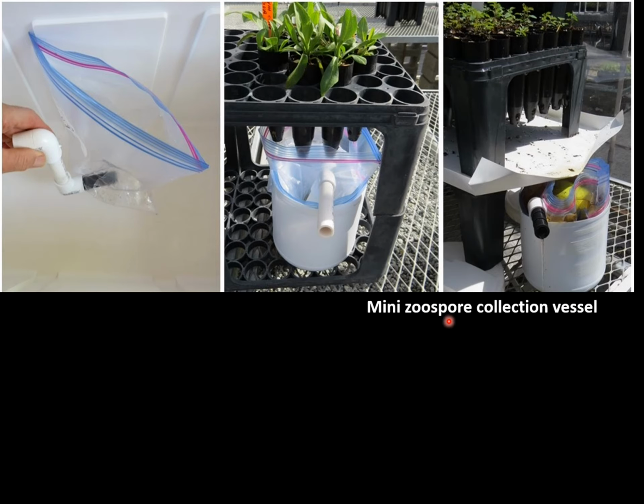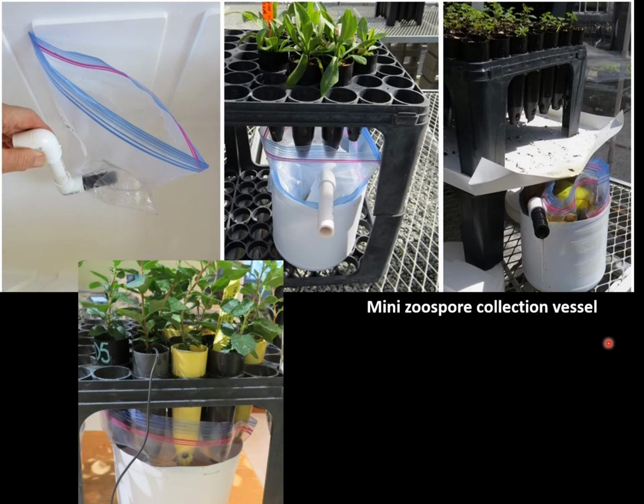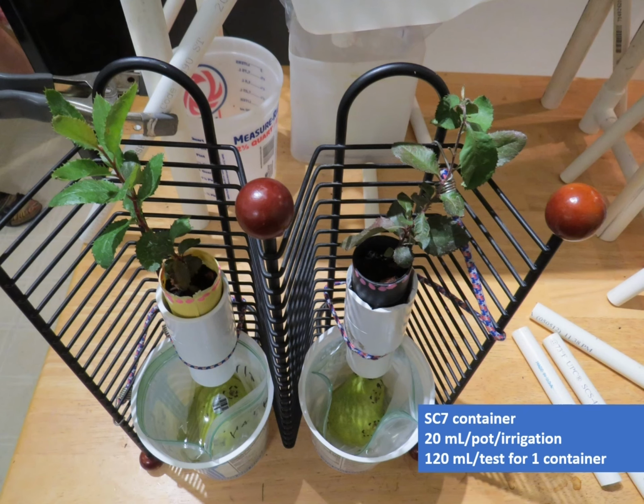This is our mini zoospore collection vessel. We know we're just going to have barely over the amount that fits in a bag, so we can equip a bag with the same type of drain that the standard vessel uses and work at that for these small numbers of plants. And in fact, if you know you're not even going to overrun the bag, you can just drain it directly into the bag. We've done that for even single containers.